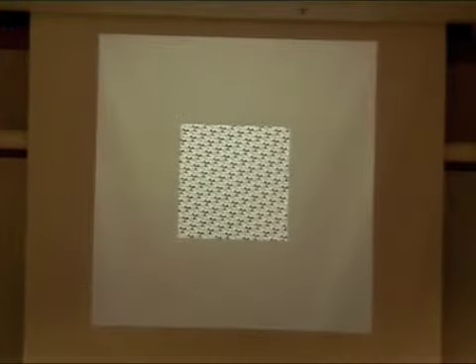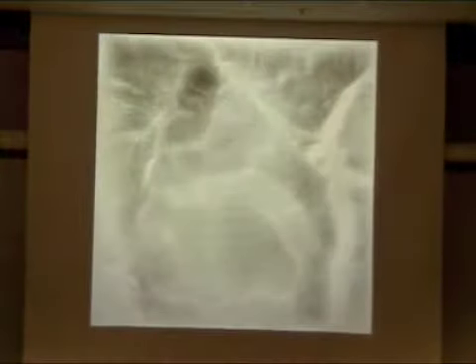This, again, is negatively stained, so it's very high contrast and so on. But you can again see these poor crystal regions up here and a much better crystal region down here. So you find something that looks pretty good, you cut it out, and then you use that as the reference, as Anshi said. You cross-correlate and do the whole unbending thing, find your distortions and so forth. And then, this is going to be the only mathematically accurate transform in my talk, you take your original image and you unbend it into your secondary image. This is going to be very subtle, so watch carefully. You're not even seeing anything really. Okay, that was it. So I'll just go through that very, very slowly. Really, the changes that are going to happen in here aren't even going to be noticeable to the human eye in general. But they are important.